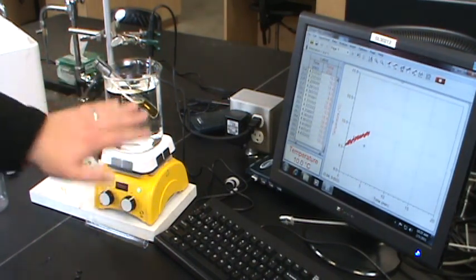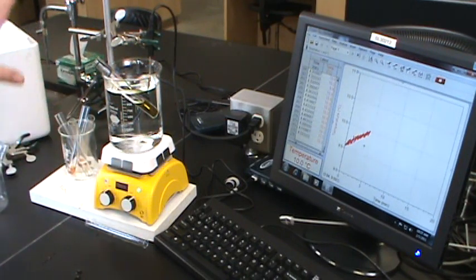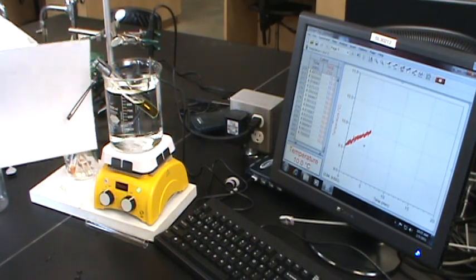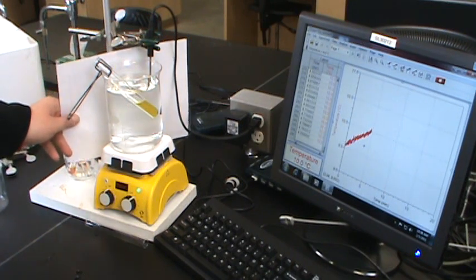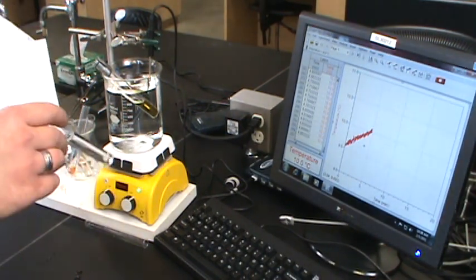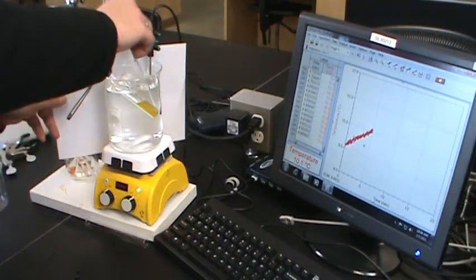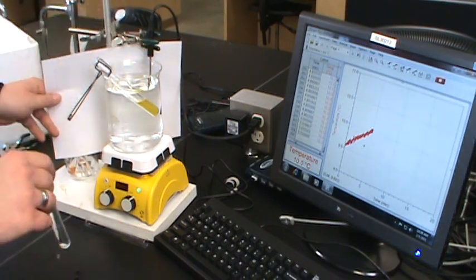Just like with the cold run, we're going to observe this by eye. This is never going to go into a spectrometer. It's just going to sit here and react in the cool bath. Just like with the cold run, it might be easier to see what's going on if you've got a sheet of white paper. That makes it a little bit easier to see the color. It might also help to have an actual blank. This is just deionized water in a test tube, so you can compare the two tubes to see when it really does get colorless.